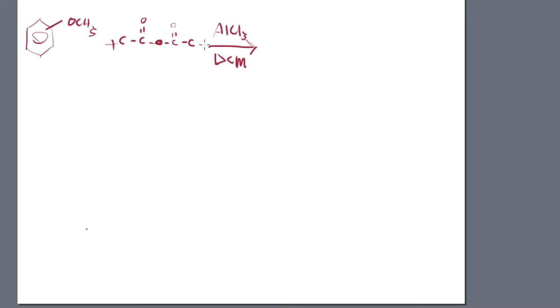So, just like I've told you in the very beginning of this laboratory lecture, we have a benzene substituted group here. We are reacting that with a type 1 or type 2 carbonyl. I hope that you're telling me type 1, because type 2 is for aldehydes and ketones, and we don't have either one here. It's an anhydride group, and we are acylating that with AlCl3, just like we discussed in all of the lecture material up to this point.